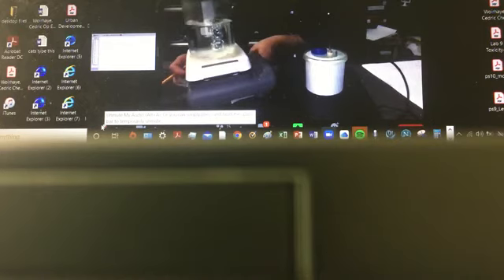Okay. So I want to bring the two as close as possible. So I'm going to remove that thermometer, so it's no longer measuring. And now I want to... So the technique is by taking the least amount of time. So that transfer has to be done with the least amount of time. So I'm going to keep that metal inside the water.